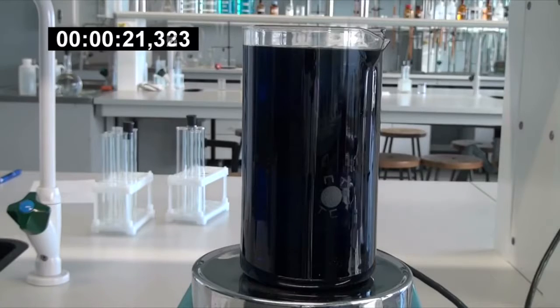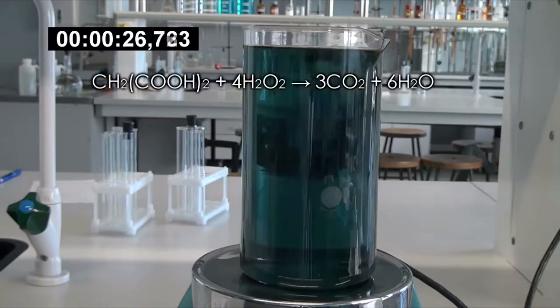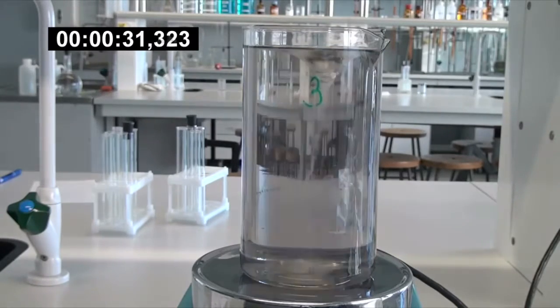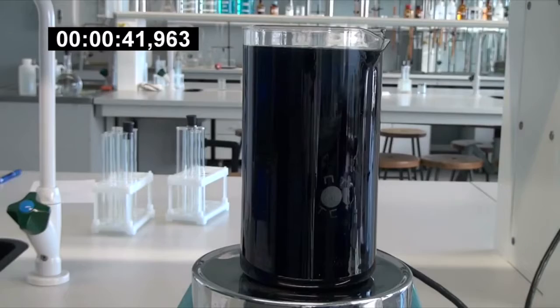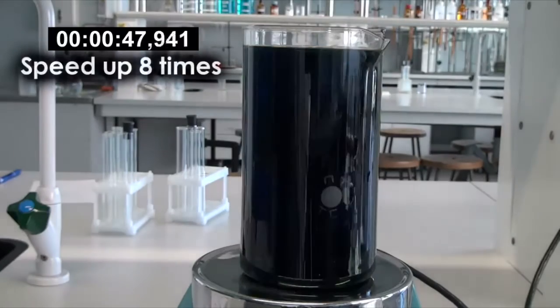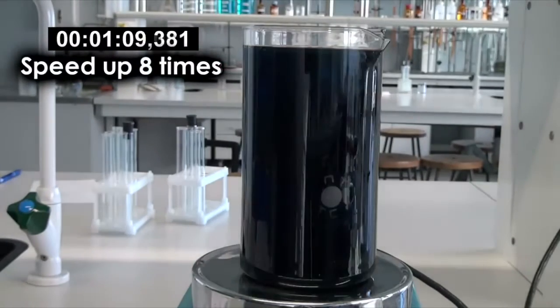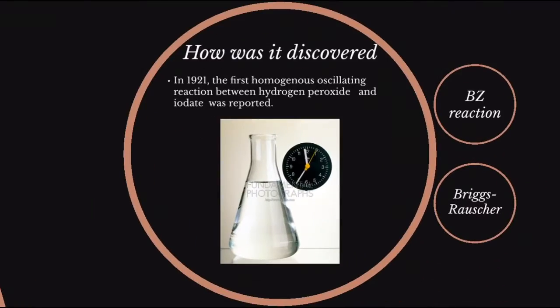This reaction is due to the oxidation of malonic acid with hydrogen peroxide. This produces carbon dioxide and water. The amber color is due to the formation of free iodine, while the dark blue color is due to the reaction of starch with free iodine. The oscillation of colors will continue until there is no more malonic acid left. If there is no more malonic acid left, the oscillation of colors will stop and will leave you with a dark blue color.